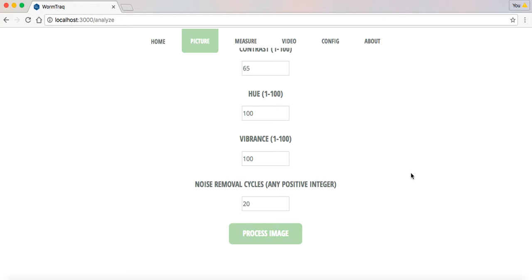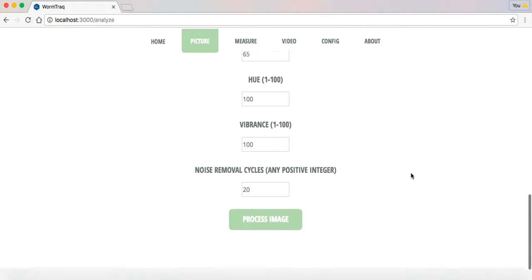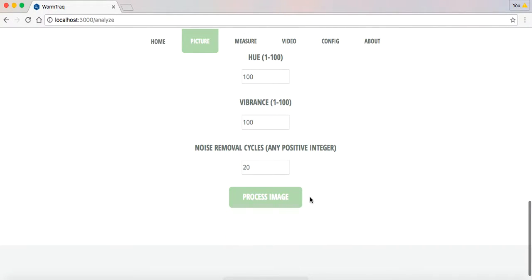Eventually, the actual worm object will be washed away, and you won't have the original object, just a fragmented, disrupted looking worm. And that may work for you, may not. You're going to test it out. So I believe we did upload something. And let's just test it out.